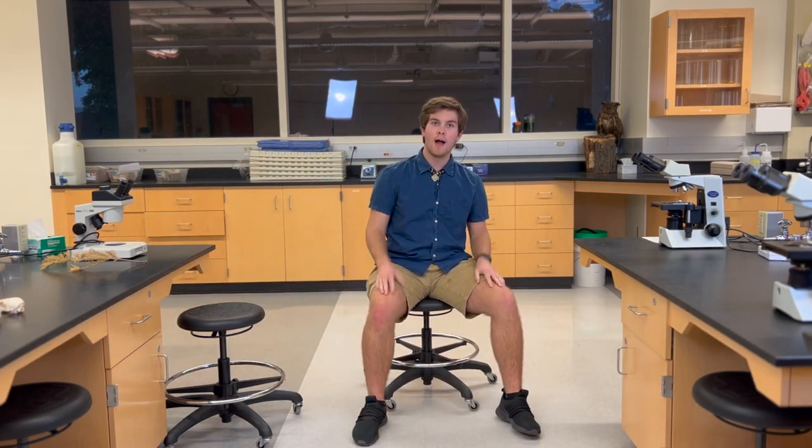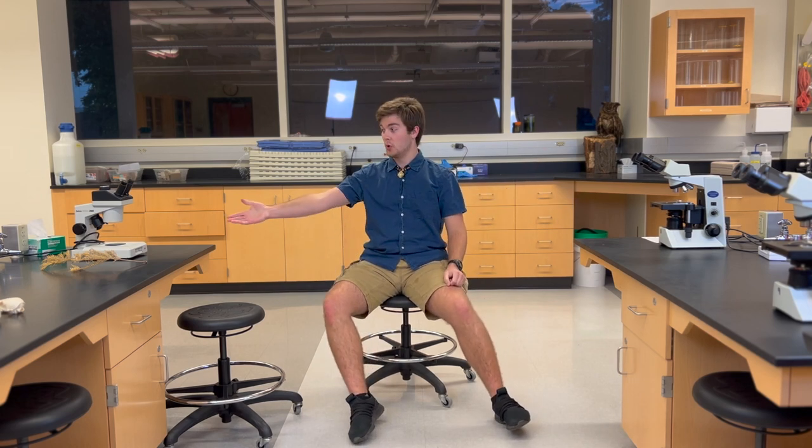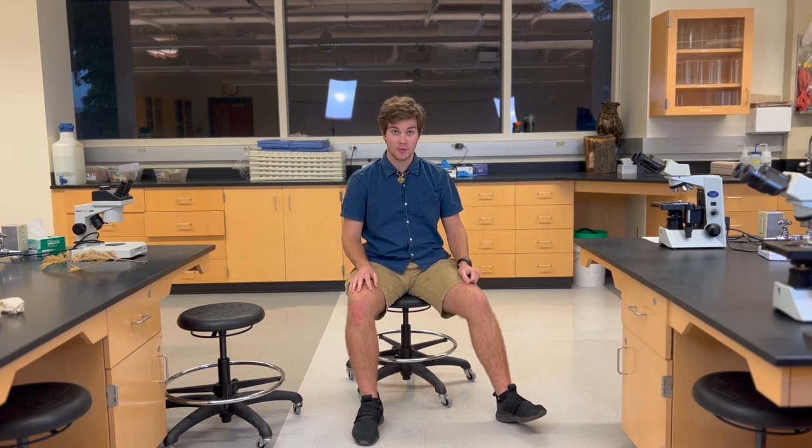Good morning, good afternoon, and good night everyone. My name is Logan and in this video I'm going to show you how to work a compound microscope as well as how to correctly operate our dissecting scopes. First though, let's start over here with our compound microscope.